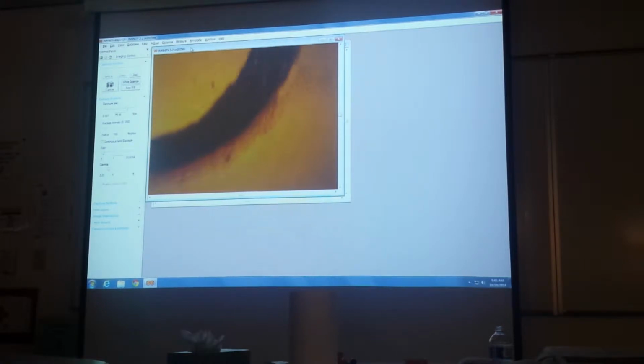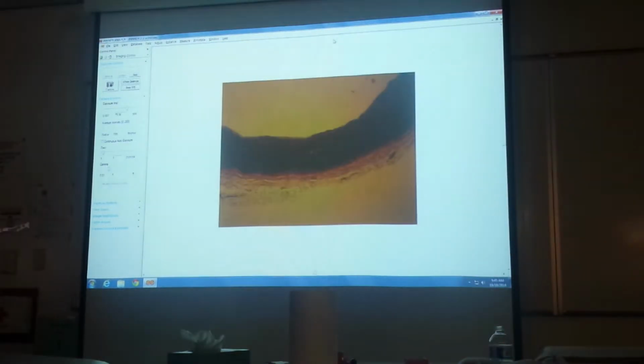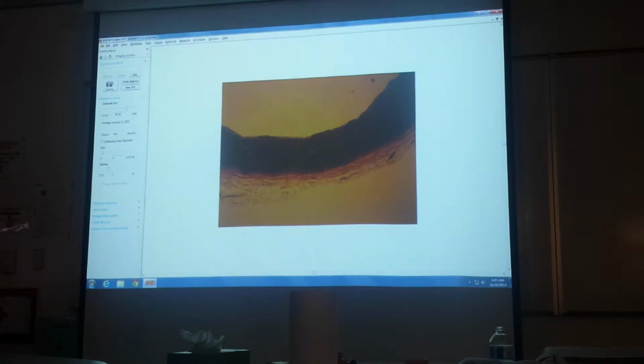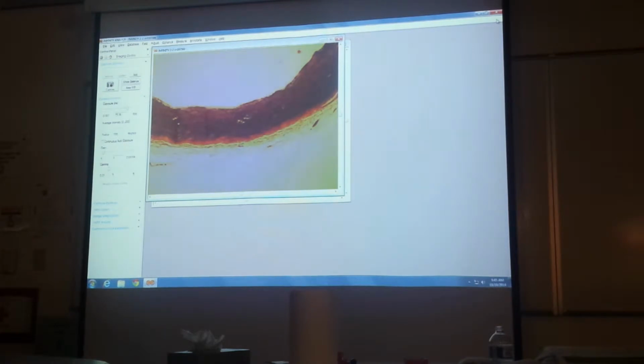Professor Wally? Yeah. I was wondering if it's okay you can maximize the screen. It's kind of hard to see. Yeah, I can, but it just does this. Oh, okay. Does that help? Doesn't really matter. Thank you, though. Yeah. I'll take pictures. I'll post it on D2L. Maybe you can blow the still images up. That's actually good.